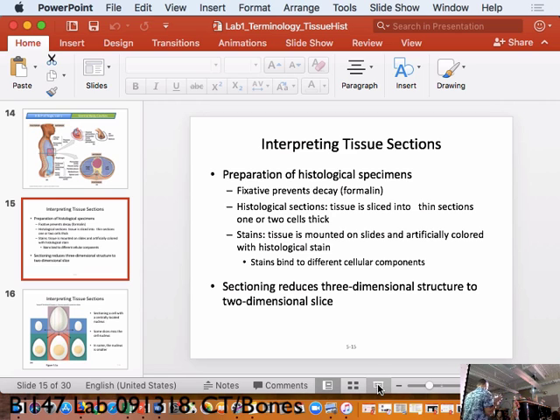What you're looking for here: there's no danger of it on the 10X, but in general, you want to go up as high as you can without the lens touching the slide. It's no problem on 10X, it never will. But on the higher ones, you have to be careful of this, because this is how you break the slide. So you don't do it with your eyes in the scope. You do it looking away to make sure that the slide is never touching. And then you put your eyes to it, and you dial it back towards you to bring it into focus.